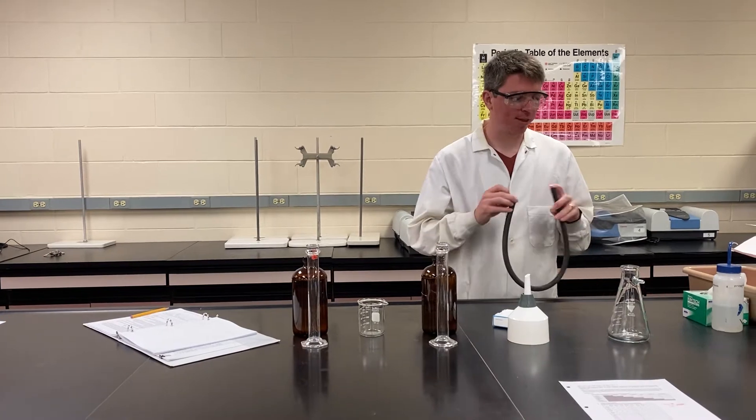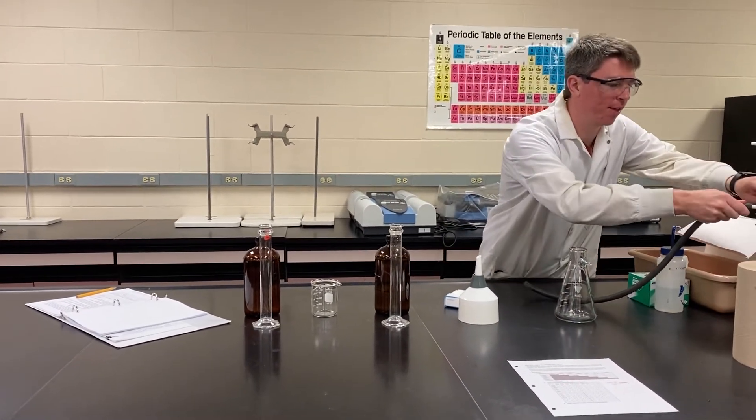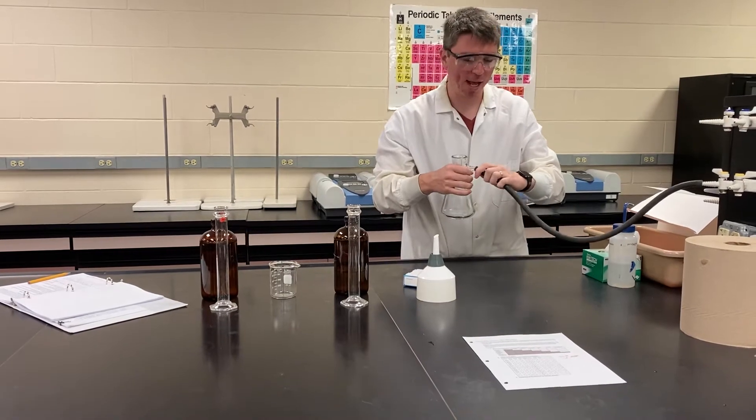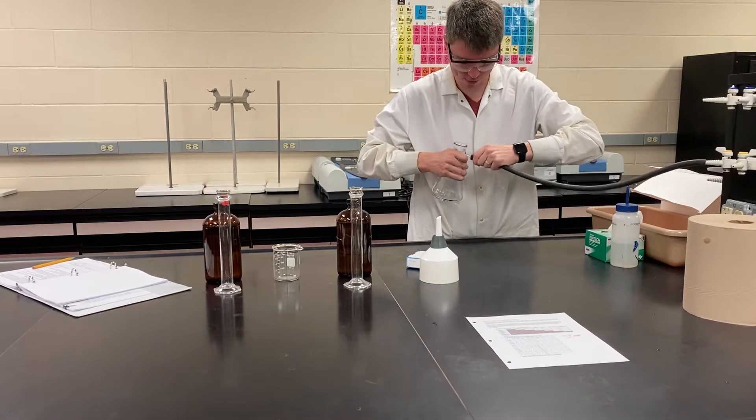The first thing we're going to need to do is set up what's called a vacuum filtration apparatus. We need to put this heavy vacuum hose on the vacuum outlet. Make sure if you're in a lab that has multiple — like gas, vacuum, and air — make sure you're hooking it up to the right one.